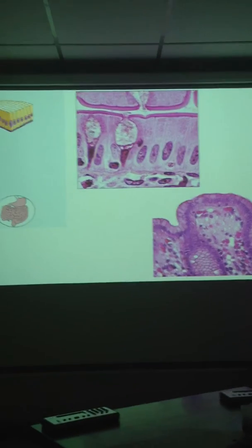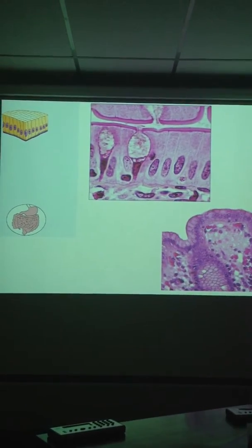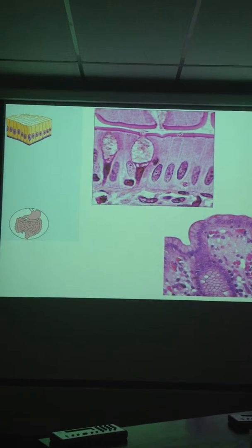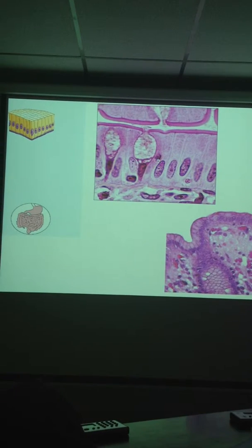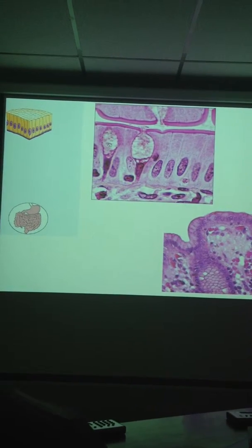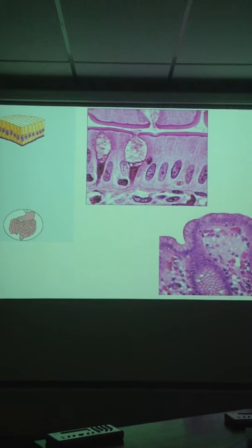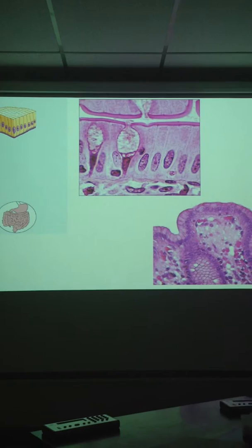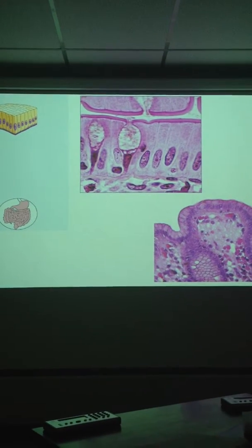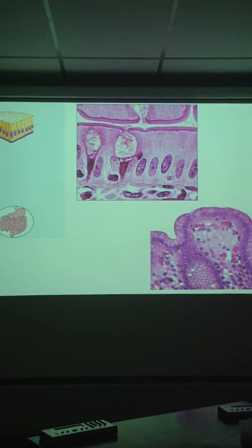Type? Simple columnar. Yep. Microvilli as well. See the fuzzy brush border there on top? Goblet cells. Locations? Right, so if you just think digestive system and I ask for 3 locations, you can use digestive system for all 3. Stomach, small intestine, large intestine. There you go.